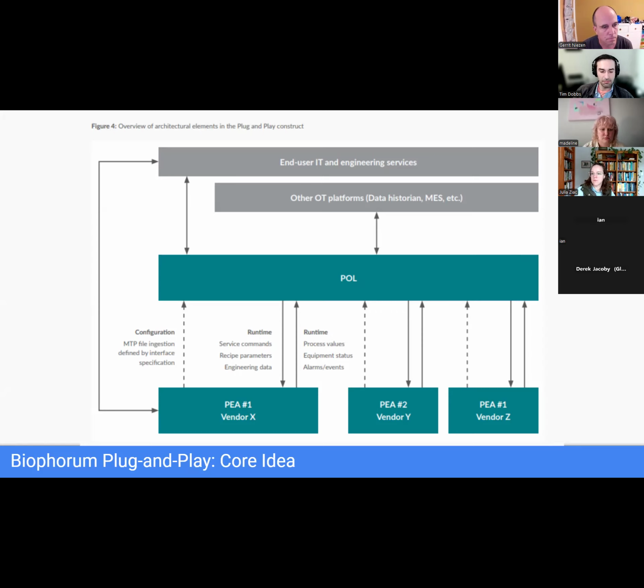So it's almost like, here's how I want you to talk to me, POL. And those all sort of work on a specific specification. So there's a set of primitives, and then you say, given those, you can send me the following commands, and I will accept them. And this is all written up actually. They marry a handful of other existing standards. So there's a bunch of European standards, and then in America we have ISA, which also does some of this stuff. I mean, ISA is international, but I don't know, I hear it less in other places.